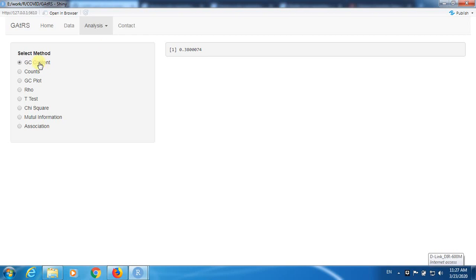This is a very important metric in bioinformatics, especially when you are performing analysis on the gene sequence of any biome. You should be knowing the importance of the GC content. GC content stands for the base pair of the nucleotides, guanine and cytosine. It is a highly significant metric in bioinformatics.